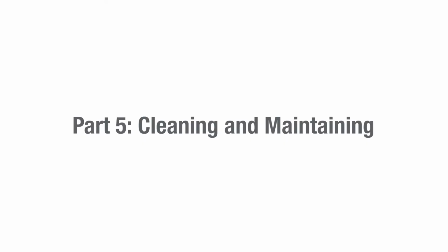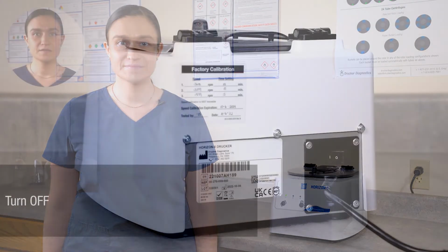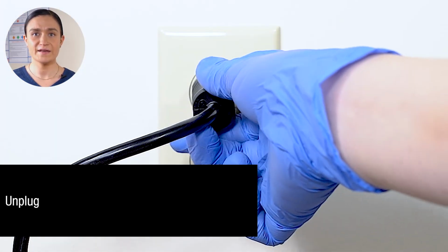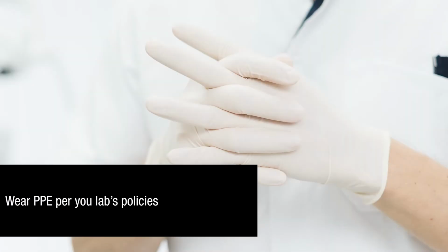Part 5, Cleaning and Maintaining. Your Horizon 6 requires no regular maintenance. Cleaning is easy too. Start by turning your Horizon 6 off. Then unplug it from the wall. Your centrifuge should always be off and unplugged before you do any kind of cleaning. Make sure to wear appropriate PPE in accordance with your lab's policies.